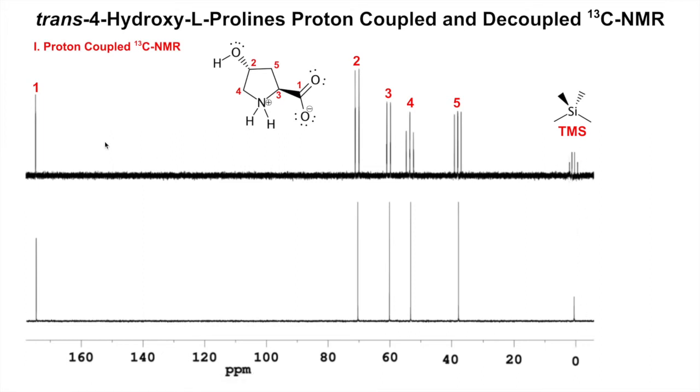Okay, so why not just use this spectrum for a carbon NMR? Usually these splittings will occur so much that they'll start to overlap and make a big mess. This is a situation where it was set up very carefully, where you only saw short-range coupling.